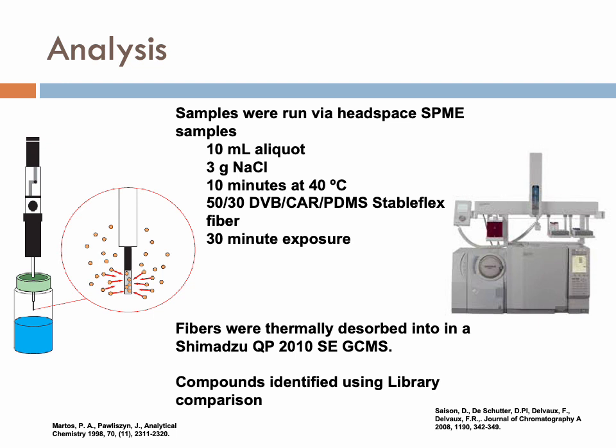We were then able to separate those compounds from each other, and using mass spectrometry, we're able to give a rough estimate, an idea, I guess would be a better term, of what compounds are present. Those are the conditions. If you're an analytical chemist, those are important. If you're not, don't worry about that.